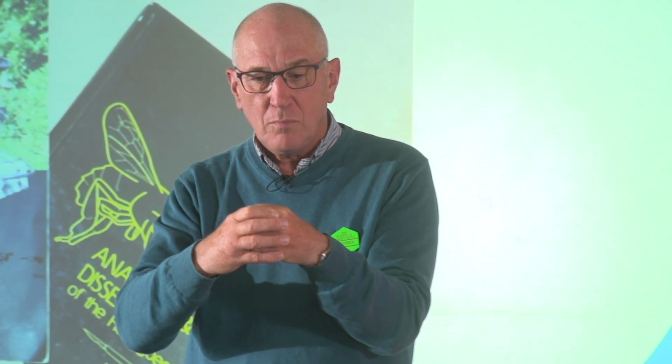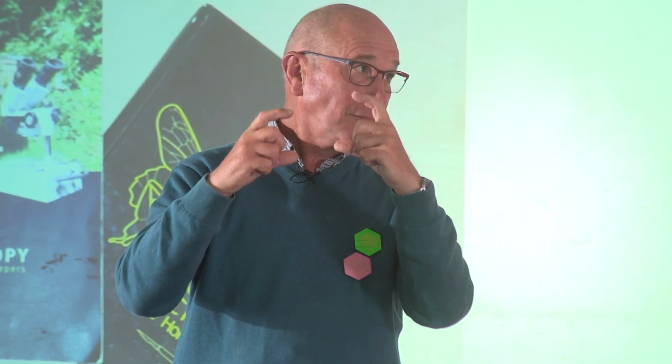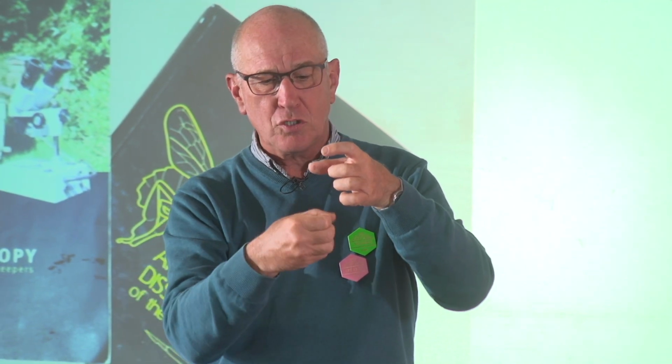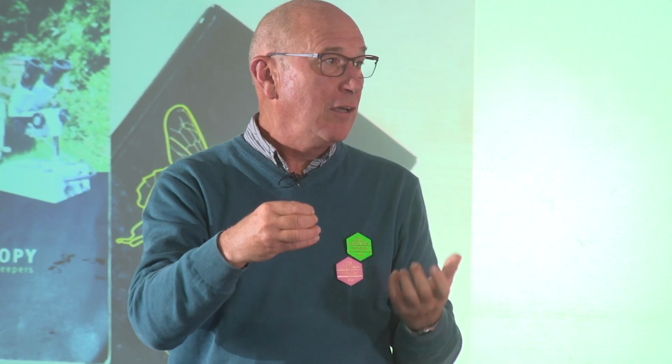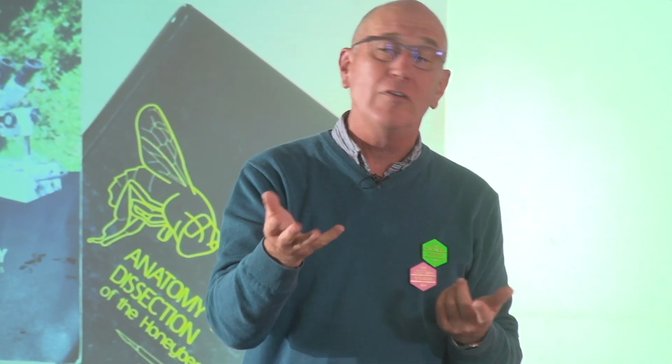But if you have something which can hold them, that helps. Just as good, I use cameras which I take photographs of insects with. The cameras which you can now use to photograph insects, which autofocus, normally have an adaptation on the end, which you can put above, for instance, a slide of a leg, and that takes as good a photograph as anything.